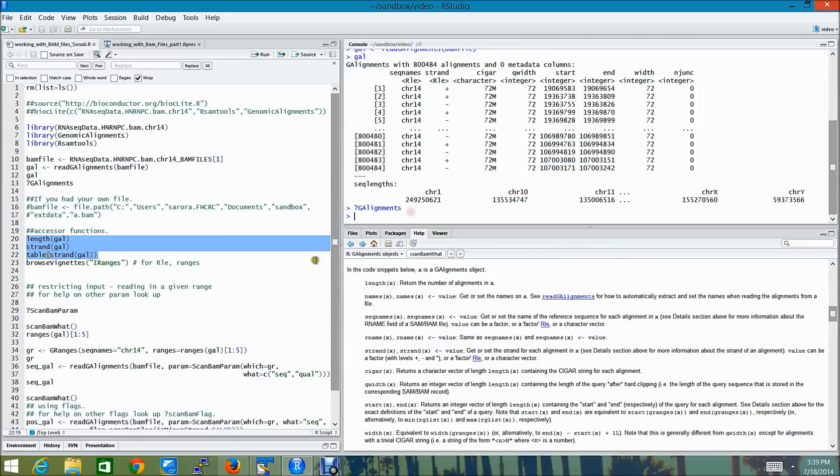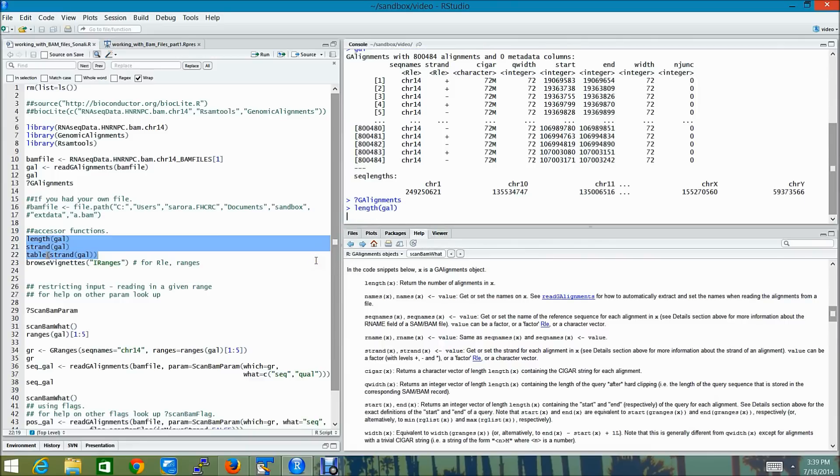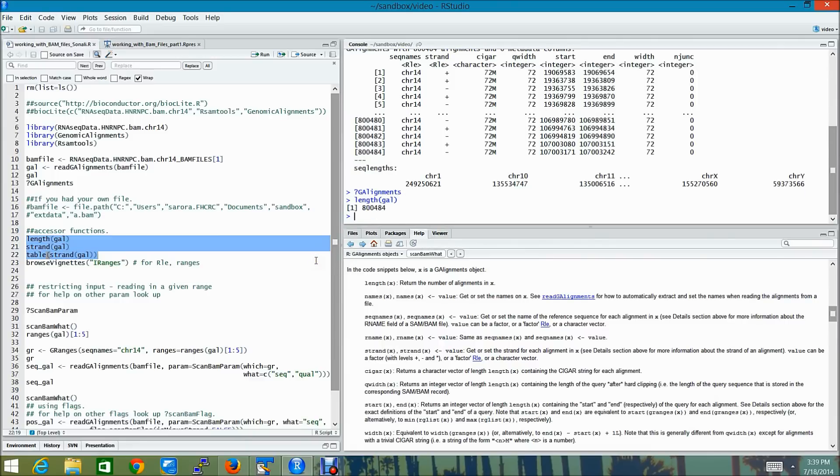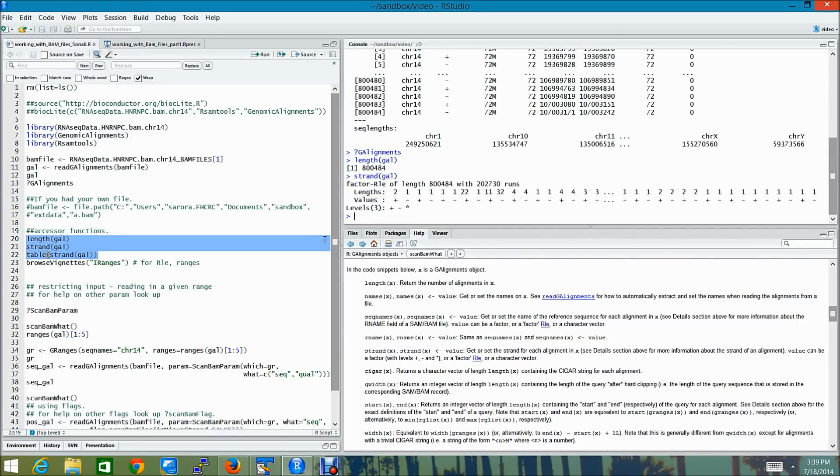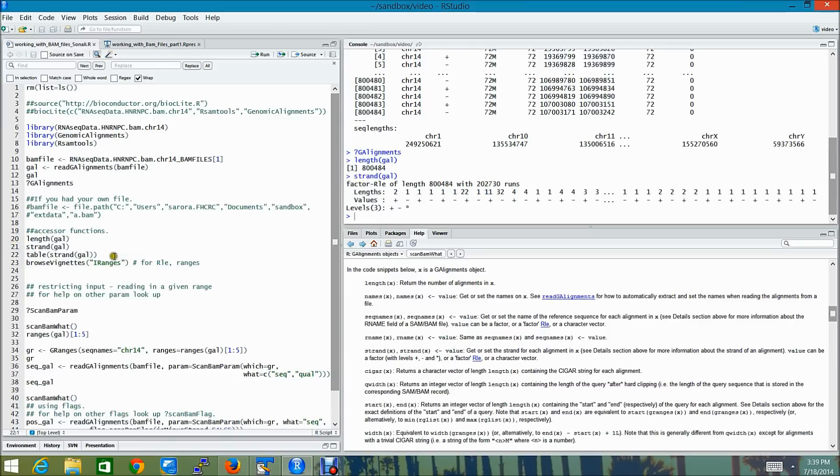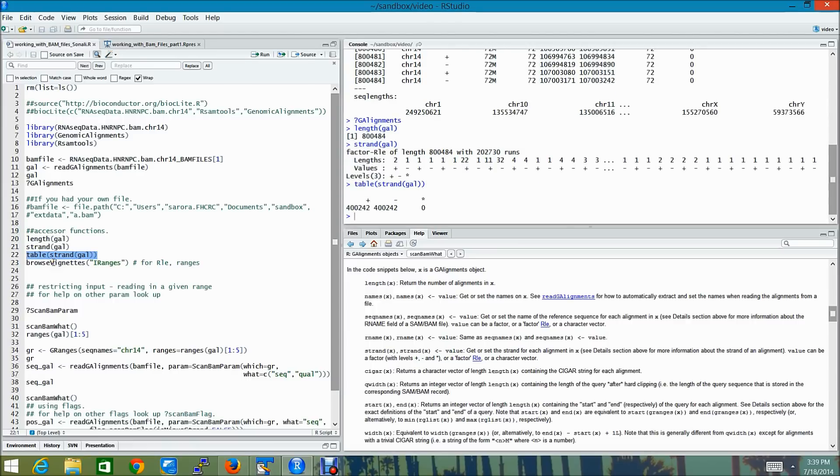And for example, if I wanted to find out the number of alignments in gal, I would simply do length of gal. I can also get the strand for each alignment in gal by using strand gal. And then to get a count of the total number of reads aligned to the positive strand and the total number of reads aligned to the negative strand, I can just use a table on that.